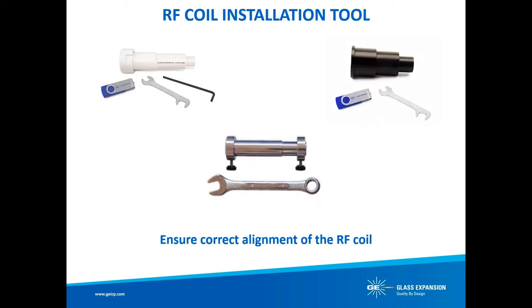In addition to RF coils, Glass Expansion also offers proper installation kits. These ensure correct alignment of the RF coil with respect to the torch body, which reduces de-vitrification on the outer tube. Each kit comes with the necessary alignment jig and tools, as well as a USB drive containing instrument-specific installation instructions, saving you time and the cost of a service call.